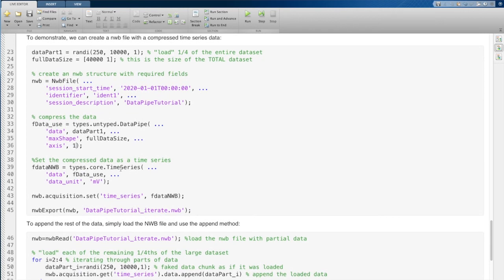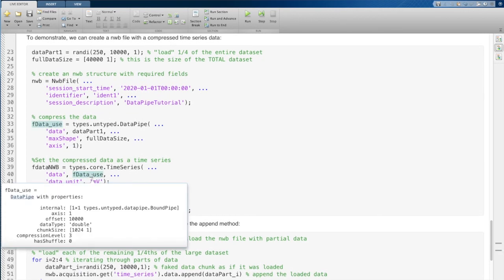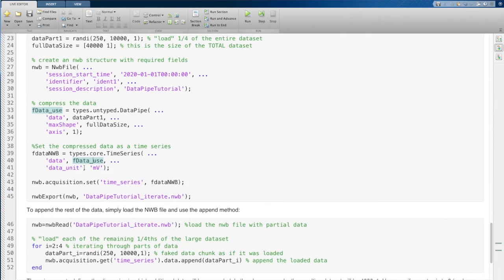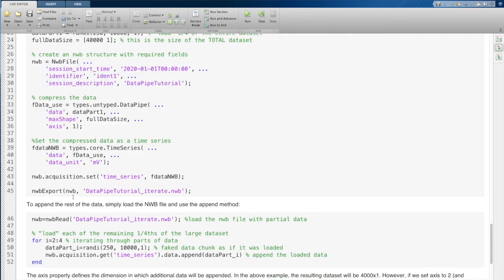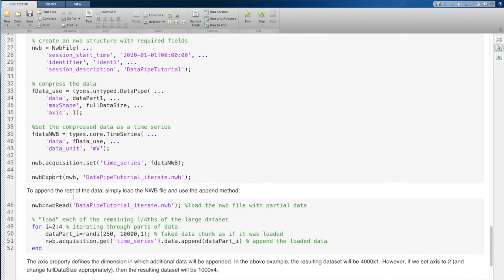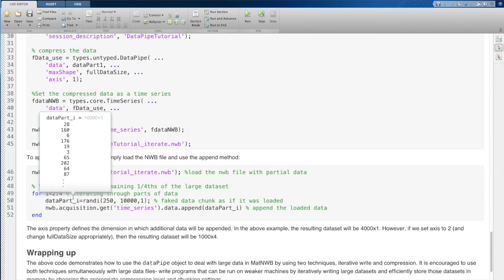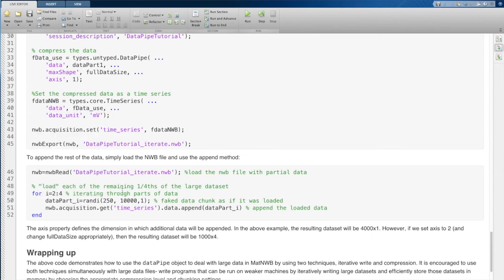Now we create our time series object, put this data type object in instead of the data, just like we did before, set it into acquisition, and then export this into the NWB file on disk.